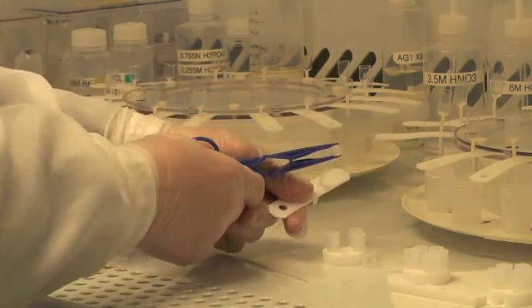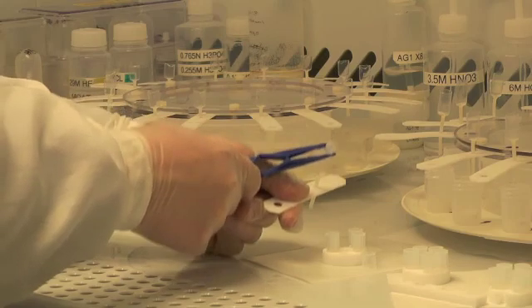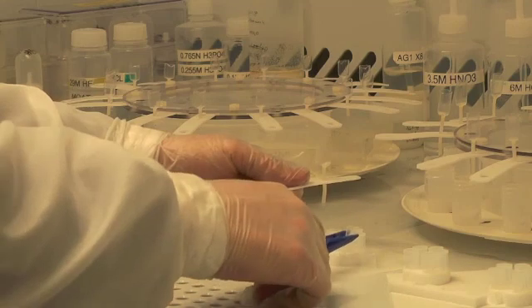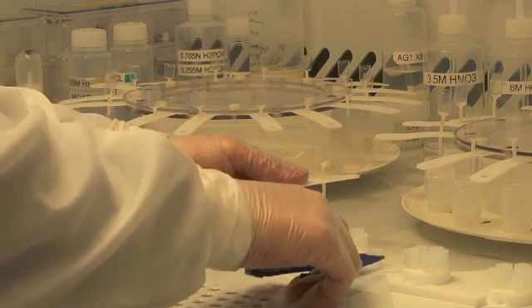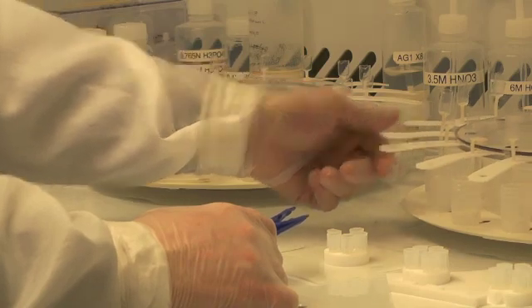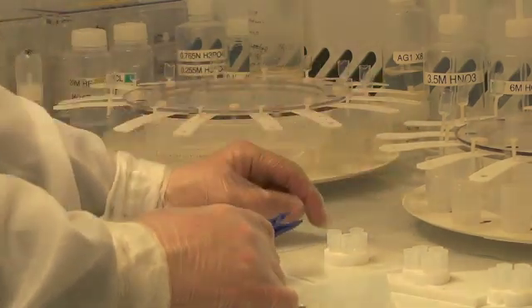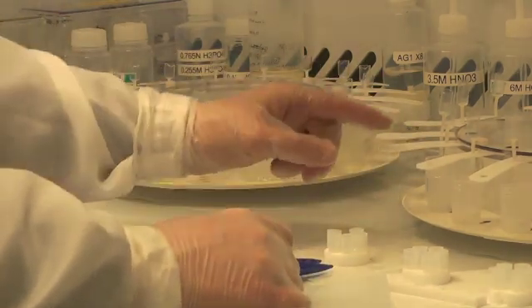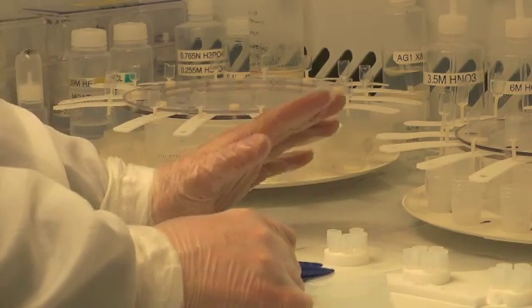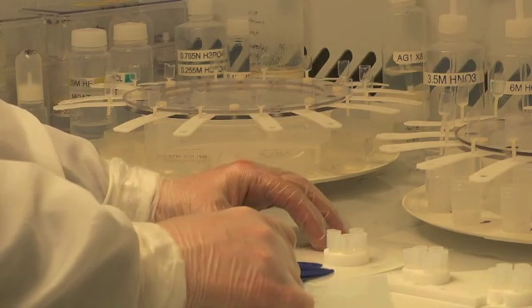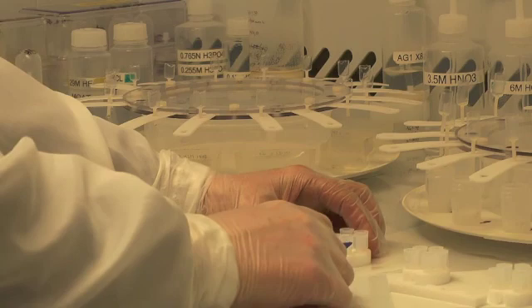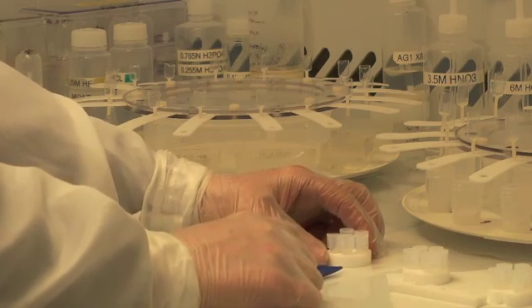The acid that I'm loading the samples in allows both lead and uranium to stick to the column. The loading acid will drip through the column and be collected in the beaker. In this case, I'm collecting that acid which does not contain uranium and lead because it contains other elements of interest, specifically hafnium which we can measure by other forms of mass spectrometry for its isotopic composition.